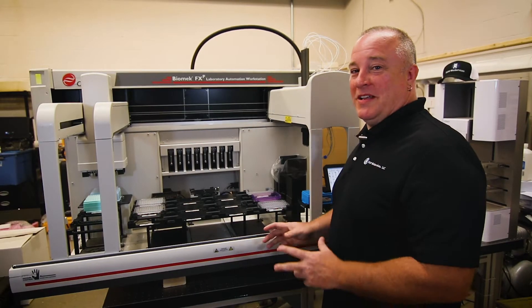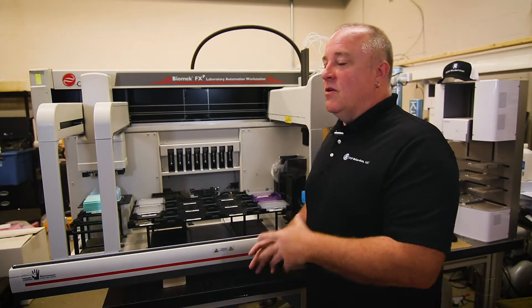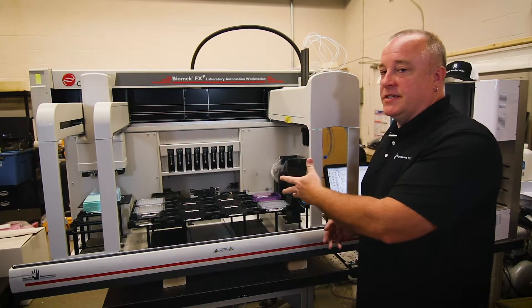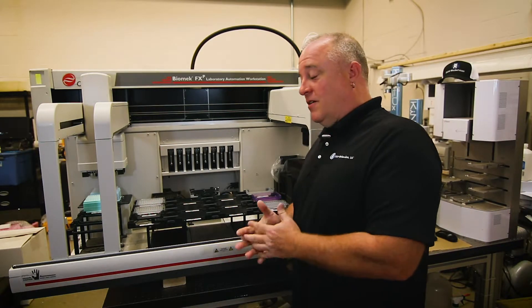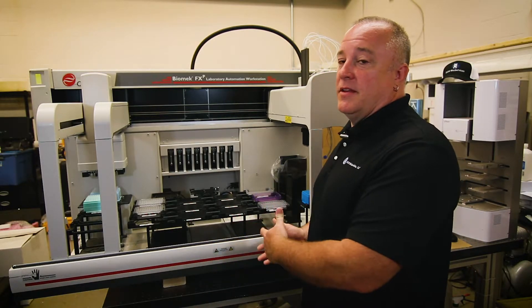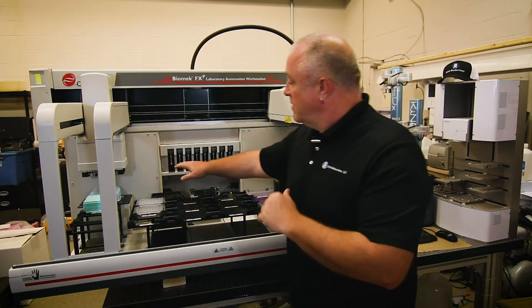I just wanted to mention a few ways that this can be done for purging the syringes. The best practice is to do a homing procedure at the beginning of the day or before you start using the instrument. At the end of the homing procedure, the SPAN 8 will do the purge syringes as part of its procedure. First, you want to check to make sure that your supply carboy is full and your waste carboy is empty, because you don't want to run out of fluid during a method and affect pipetting accuracy. So make sure there's no air in the syringes.